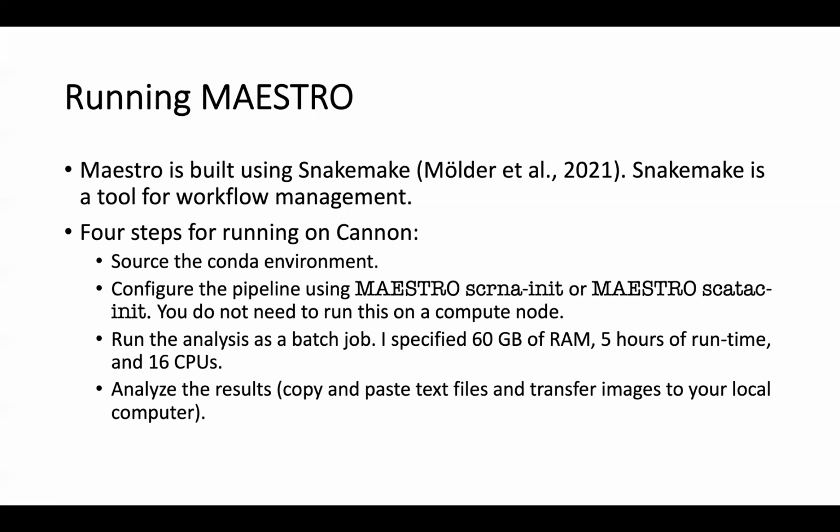Once you do that, you want to configure the pipeline using either Maestro single cell RNA initialize or Maestro single cell ATAC initialize. This only takes a few seconds and you only need to do it once. So for example, you don't need to start a compute node to run either of these two commands.